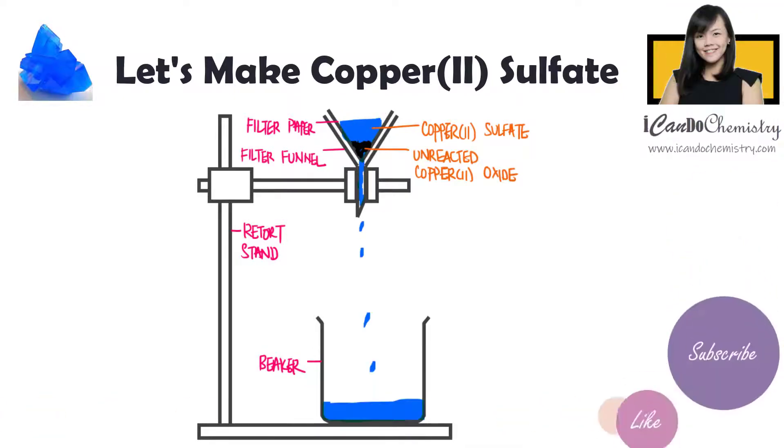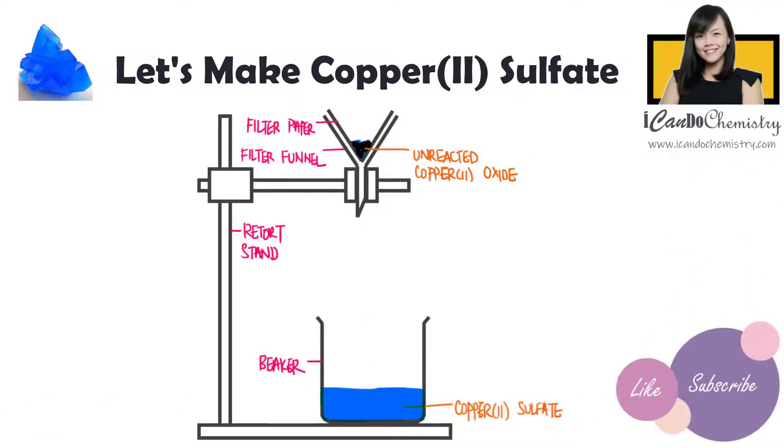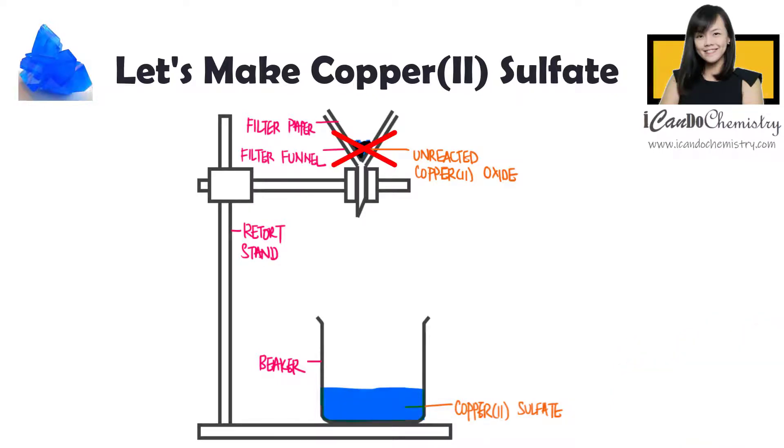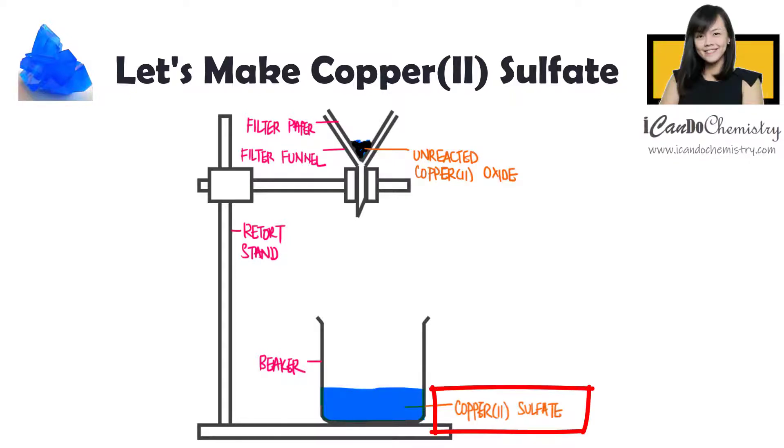The unreacted copper-2-oxide will get stuck in the filter paper as residue. We don't want this, so we dispose it. Copper-2-sulfate solution will be collected as the filtrate. Here we have copper-2-sulfate salts dissolved in water.